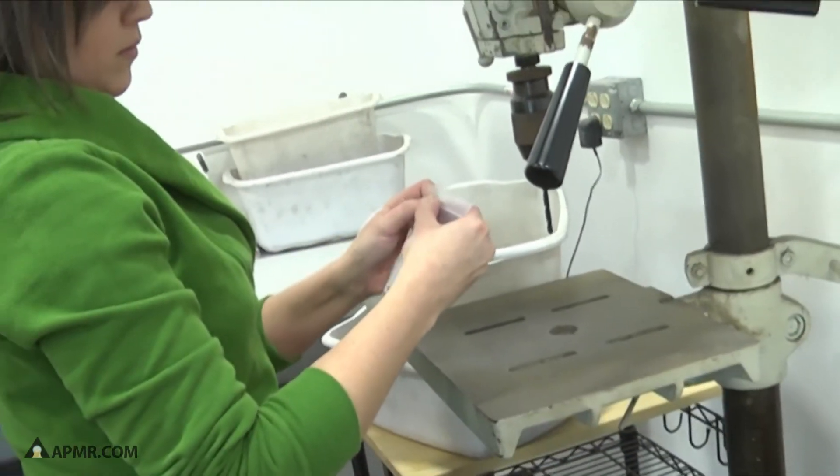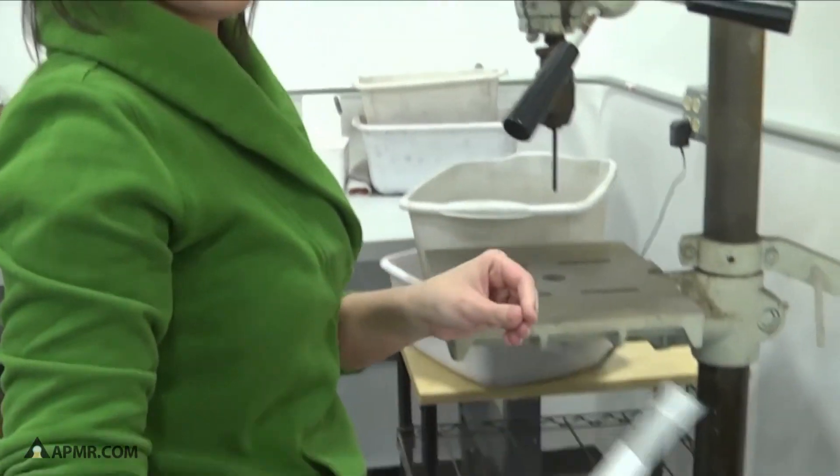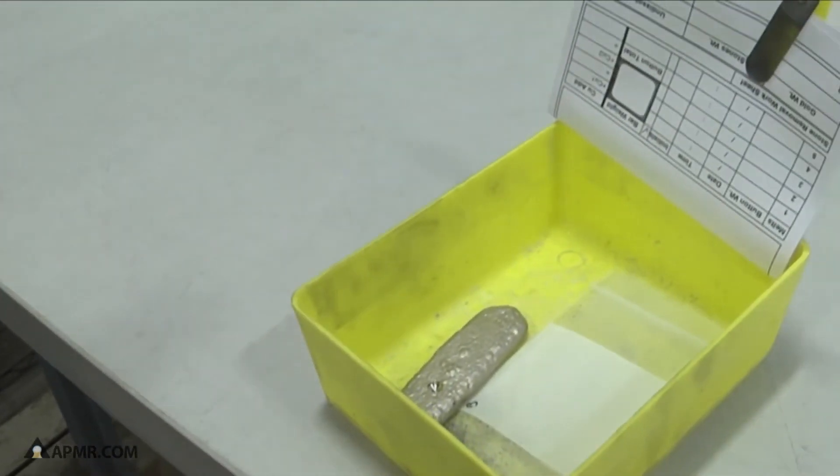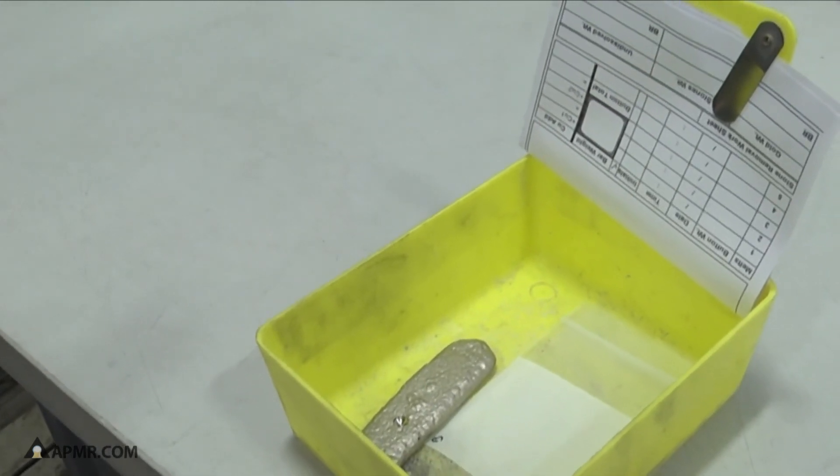And now we have our two samples from one bar. The reason we take two samples is for lot verification. The next step for these is over to the assay lab.